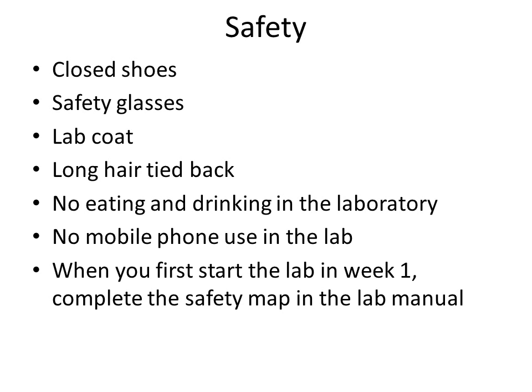The only exception to this rule is that you may use your camera to photograph some results for your report, such as your TLC plates. There's a safety map in the lab manual which will help you identify all important safety features. You must complete this map and have it signed by a demonstrator when you first come to lab before starting any experimental work in the first week. If you've completed a lab session already, then you don't need to redo this. You can just show your demonstrator that it's been completed.